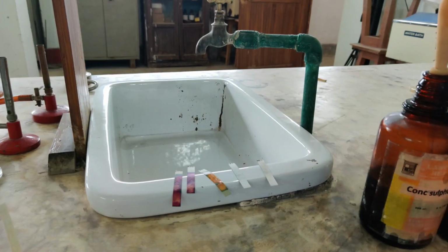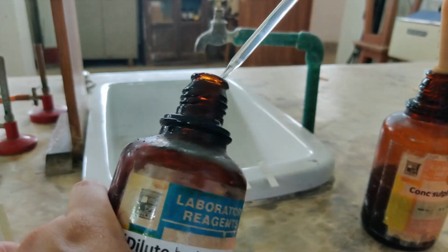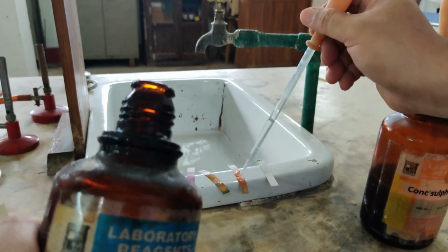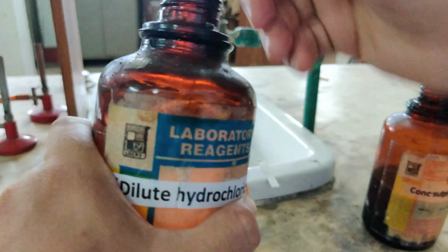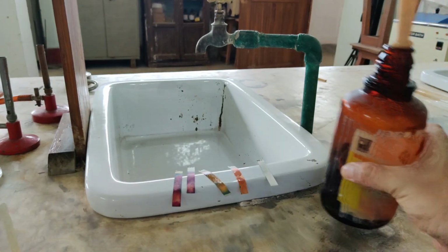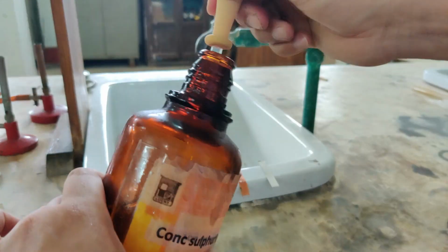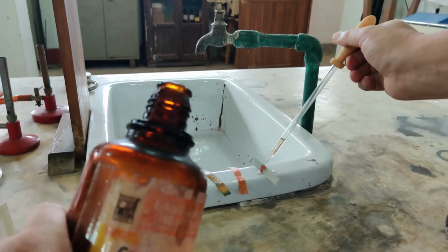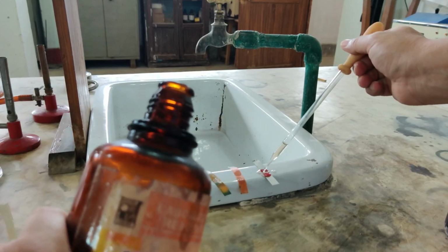Then the next that we have is dilute hydrochloric acid. Here dilute hydrochloric acid. I am going to now test with dilute hydrochloric acid. So here we go, dilute hydrochloric acid. So color change. This is with dilute hydrochloric acid. And finally with the concentrated sulfuric acid. Now I have to be a little careful with concentrated sulfuric acid, it can be a little dangerous. Here it is, concentrated sulfuric acid. Let's see the changes here.